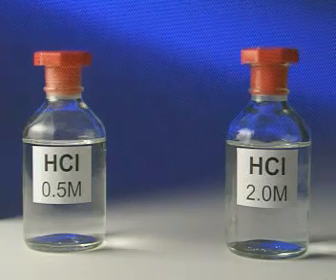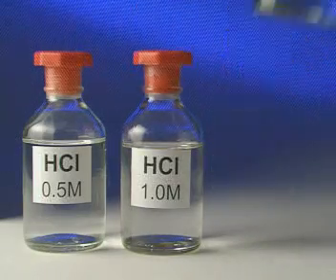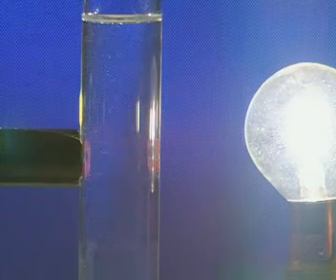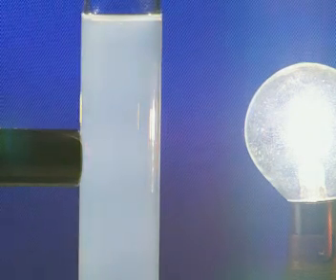The concentration of the acid was 1 molar. So what do you think will happen if it's increased to 2 molar? Once again, the data is collected and a graph of light passing through the solution is plotted against time.